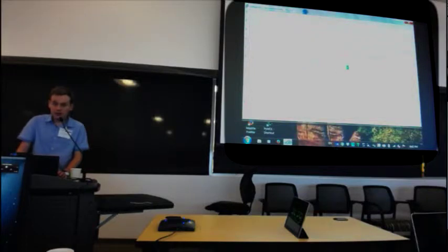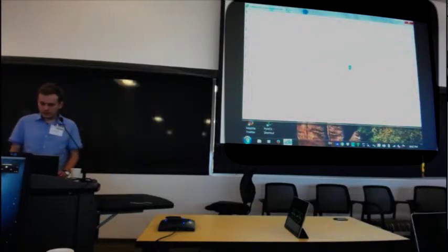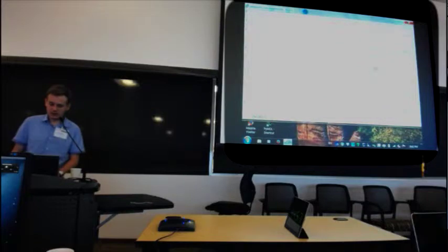It should point to your CASS tutorial directory. In my case it is Nass, CASS tutorial, CASS. Has everybody changed this line so the base dir points to your username in Scratch, CASS tutorial/CASS?